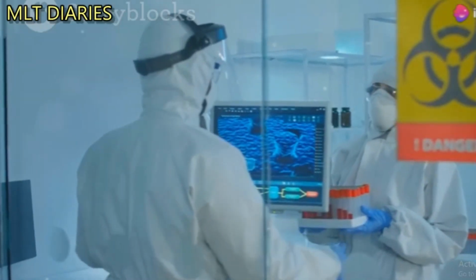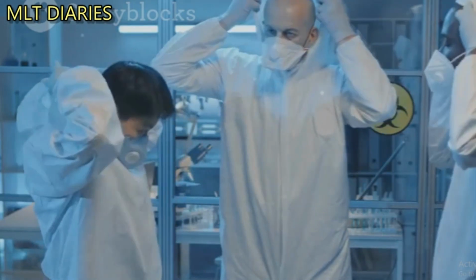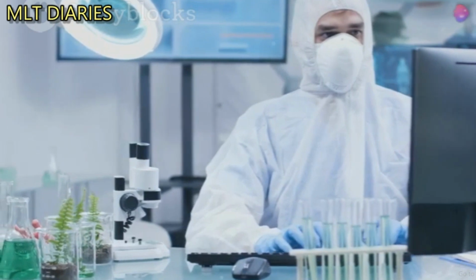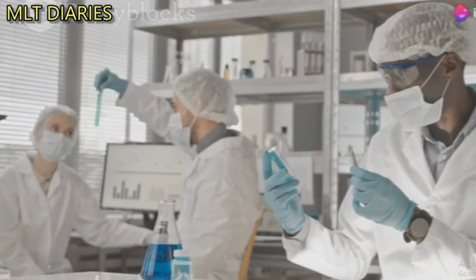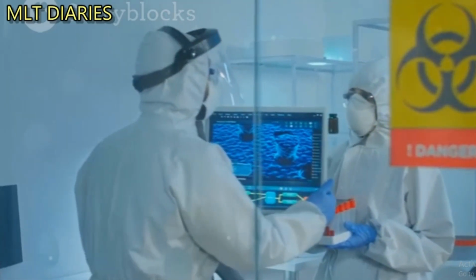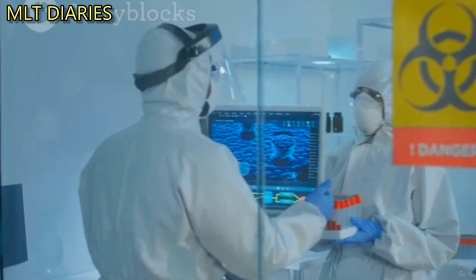Training and compliance are essential too. Make sure all lab personnel get regular training on biosafety practices. Conduct periodic reviews and audits to ensure compliance with the manual's guidelines. And finally, stay updated. Keep up with any updates or revisions to the Laboratory Biosafety Manual. Attend biosafety training sessions and workshops as recommended.